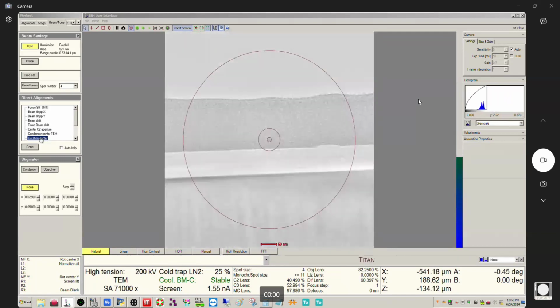So now the reason this is called rotation centering is that there's actually a slight rotation to the image as this is taking place. So when we move that rotation to the center, then we don't see the shifting anymore. Okay, so that's actually why this is called rotation center. Sometimes you can see this when the mag gets really, really low. At these higher mags, you're really not going to see that. You're just going to see a shifting. Okay, but anyways, that's where it comes from.